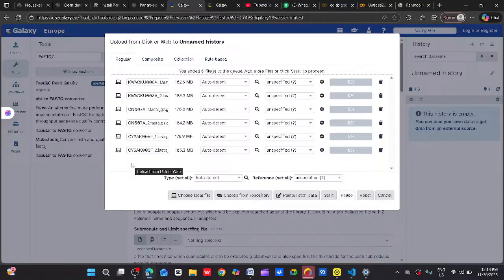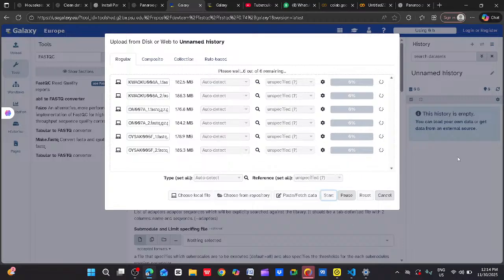After this, I have two more sequences for later. But let's not just run for these three first. By the time we run these three, let's see how it is going to be. Under normal circumstances, we are going to be dealing with three different strains. Don't forget, wherever you see one, that is forward. Wherever you see two, that is reverse. Forward, reverse, forward, reverse. So you now upload them. After you have uploaded them, just click on start.